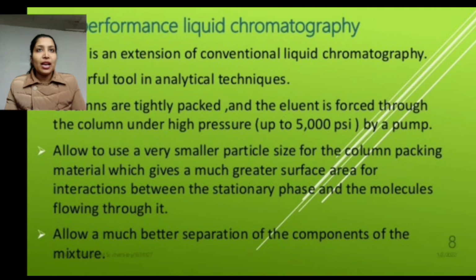It mainly utilizes a column that holds the packing material, which is called the stationary phase, a pump that moves the mobile phase through the column, and a detector that shows the retention times of molecules. The solvent used depends upon the nature of the molecules being analyzed, and the sample to be analyzed is introduced in a small volume into the system.